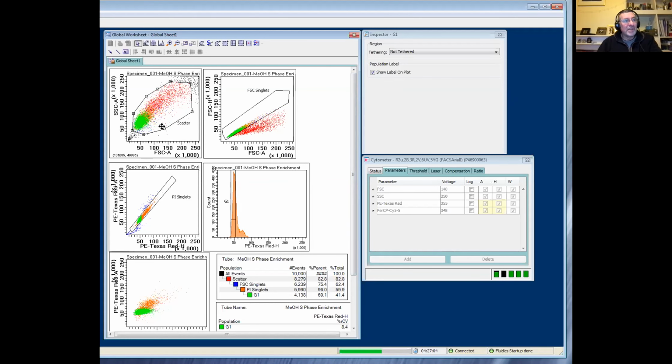Well, as Kathy said, and as we ran here, first of all, we're always going to run an untreated, hopefully exponentially growing sample, which will give us the standard cell cycle for that particular population. Often people will use DNA analysis to check the synchronization of their cells.